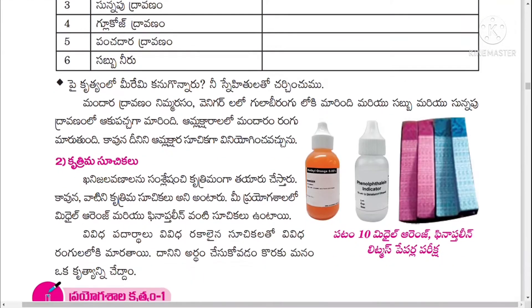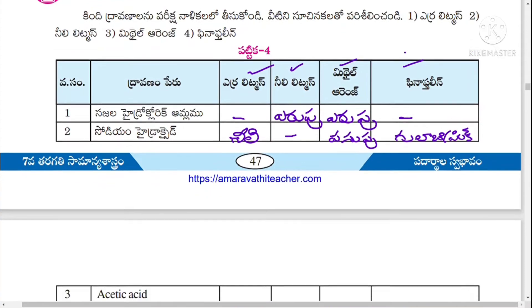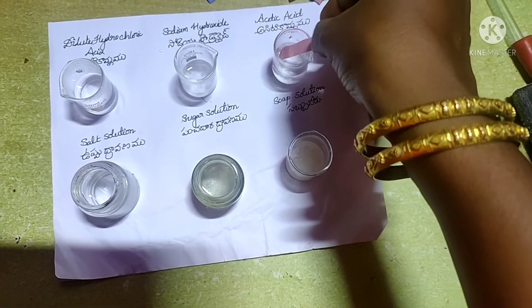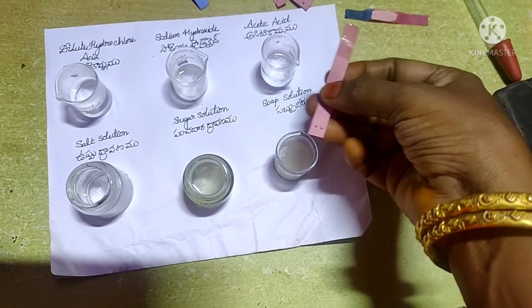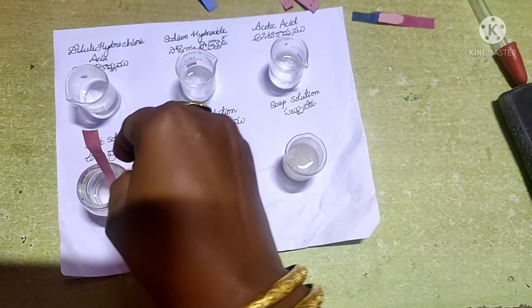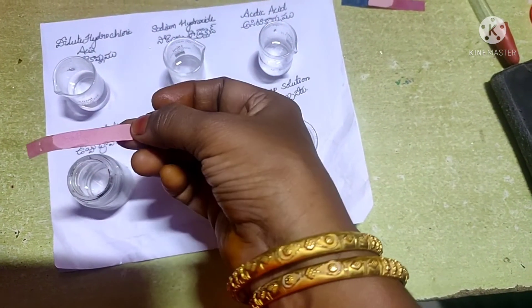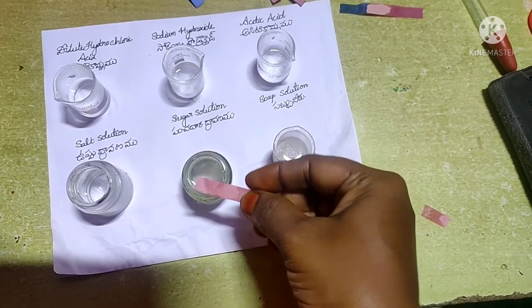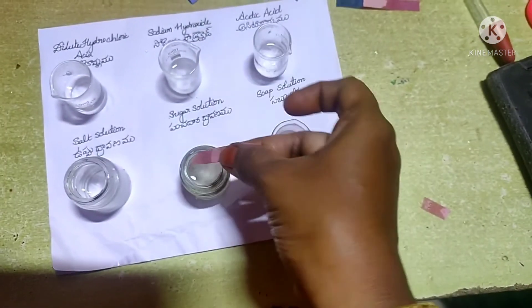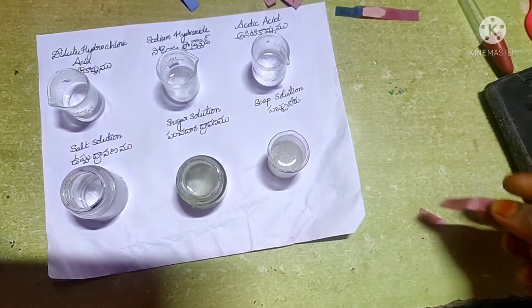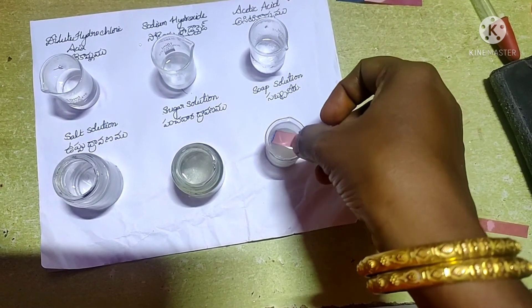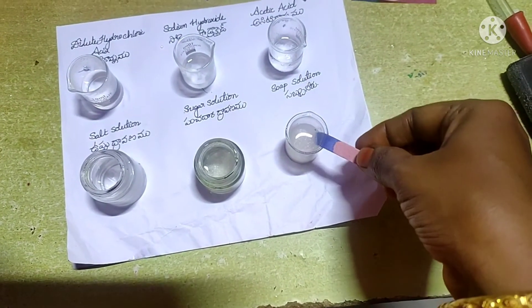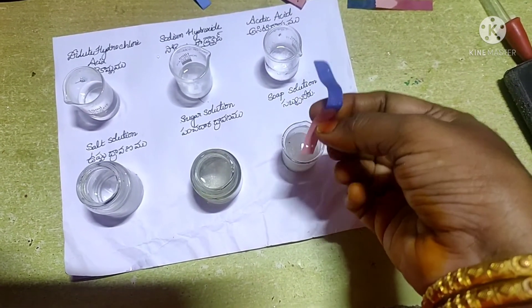Take red litmus paper and insert it into acetic acid solution — no change. Dip red litmus paper into salt solution — no change. Dip into sugar solution — no change. With soap solution, it turns blue. So whenever red litmus turns blue, the solution is a base.